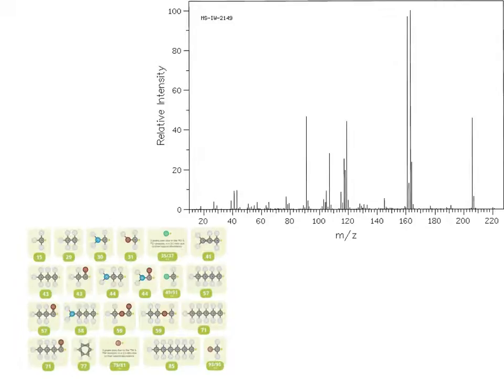So here, at 43, we can see a carbon-to-oxygen double bond, and on the mass spec graph we can see a peak that resembles that. At 57, we can likewise see a peak that is representative of a carbon-to-oxygen double bond. And at 77, we can see another peak that represents the presence of a benzene ring. Since there are no other nonmetals or halogens present in ibuprofen besides oxygen, we can finish here for our analysis of mass spectroscopy for ibuprofen.